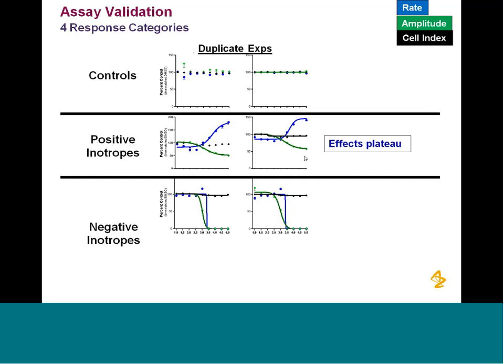Where you get into a bit of a gray area is the word contractility. Yesterday I listened to an expert panel on contractility, and one person defined it one way, a second person defined it another way. The third person chose not to define it, but to say we need fit-for-purpose assays that will give us the answers that we need and the ability to investigate it. So to say that this is contractility is an overinterpretation and would be fraught with a lot of danger.